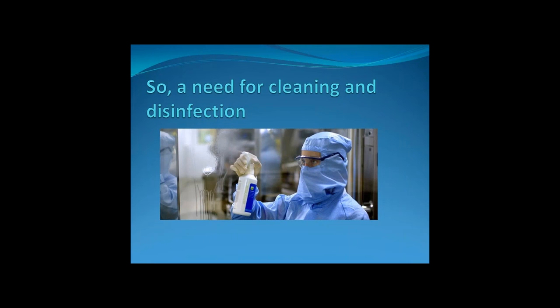So even with well-functioning clean rooms, there is a continual need for cleaning and disinfection. So where people may shed, or where surfaces will at some point in time become contaminated, there is the need for a set regime. This webinar will now go through some of the essentials for cleaning and disinfection. So we'll begin with having a look at some of the regulations, and then we move on to having a look at some of the main GMP deficiencies.